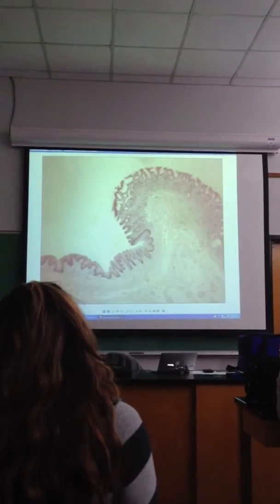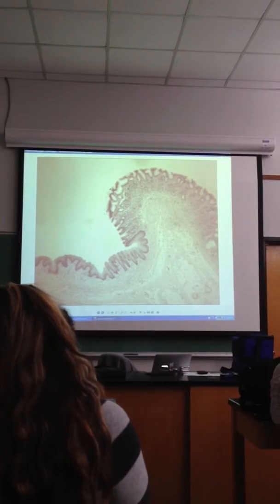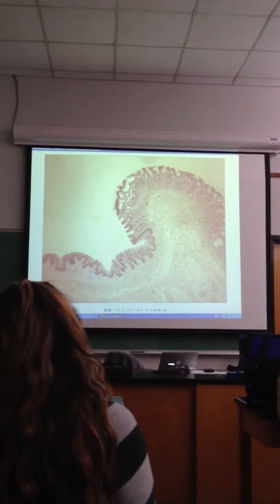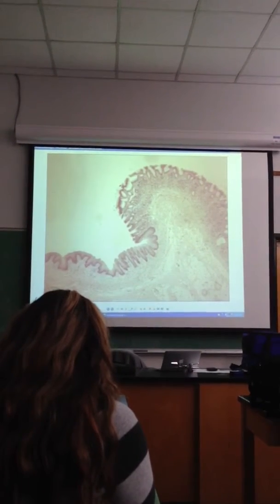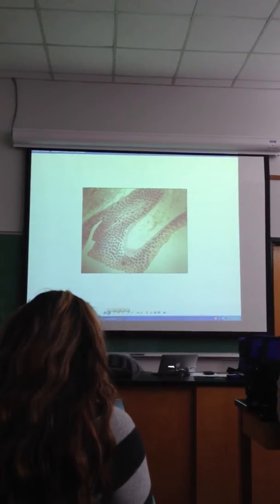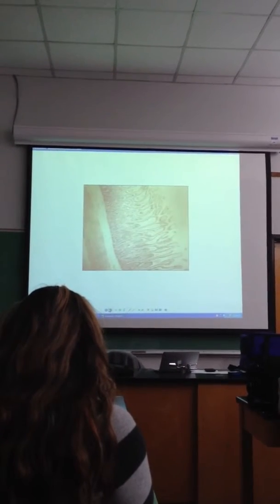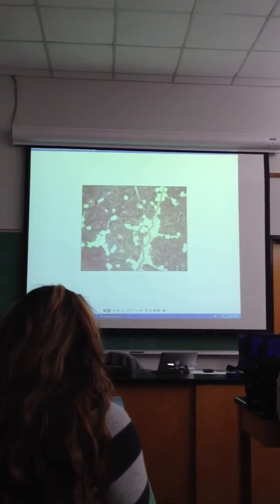And just another more magnified view, you can see more of the esophagus here, more of the stomach there. So if we didn't think it changed, you can definitely see the change in appearance from one area to the next. That moves us into the small intestine. I'm going to give you the image that usually is more distinctive.